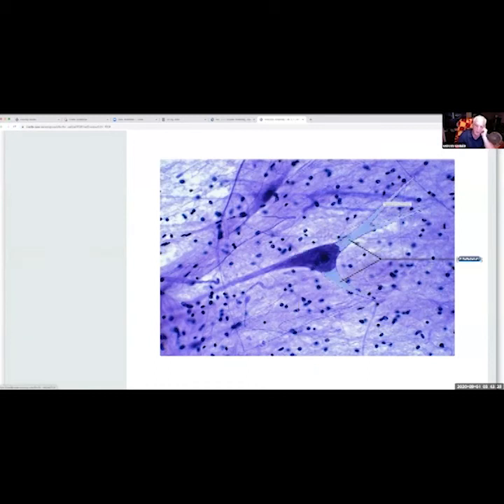And all these little dots are neuroglial cells. They form barriers, they form sheaths, they protect the neuron, they eat pathogens that come around the neurons. They make sure the neurons stay healthy and fire. But they do not have a nerve impulse themselves. So neuroglial cells do not carry an electrical impulse. Only neurons do that.